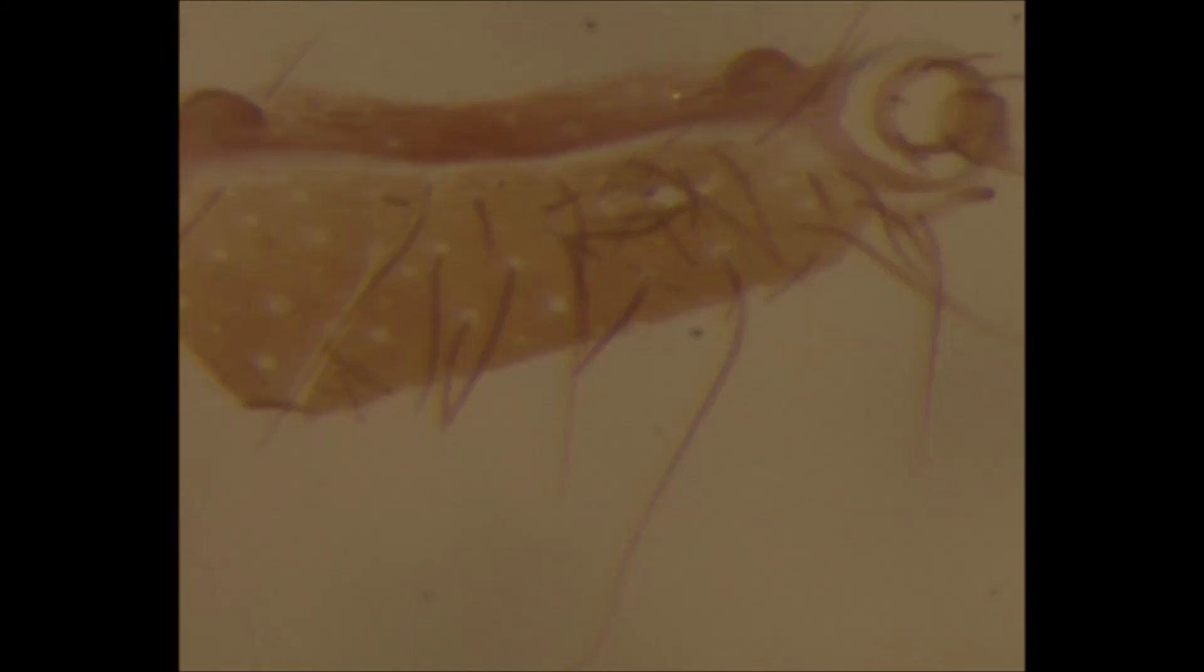But the glycerin is spreading. It looks like everything is flat. Here we have the microscope slide. You can see the edges of the cover slip and three parts we're looking for: the apex of the abdomen flattened in dorsal view, the frons and clypeus with the antennae flattened in various ways, and the epipharynx, the labrum and epipharynx.